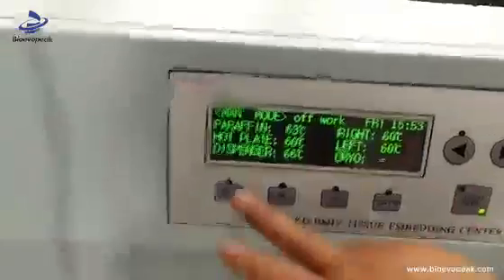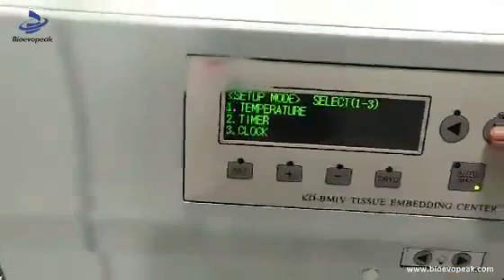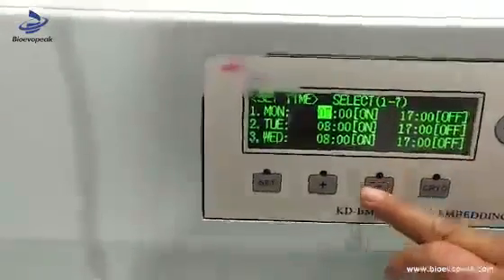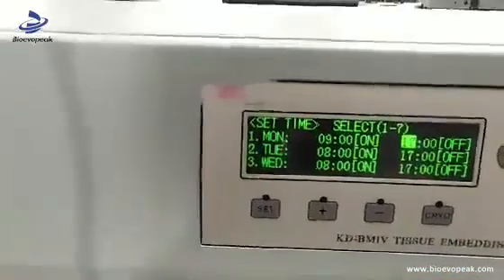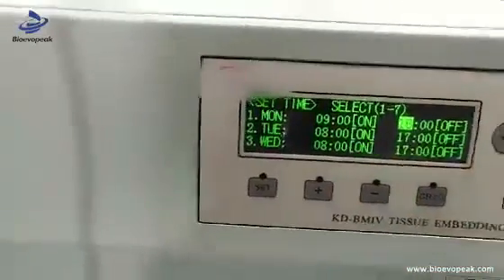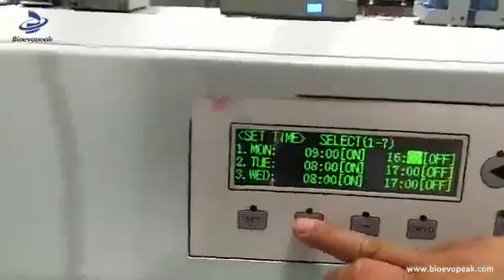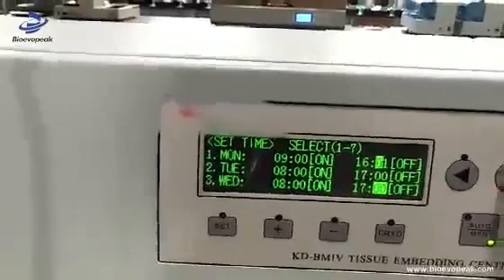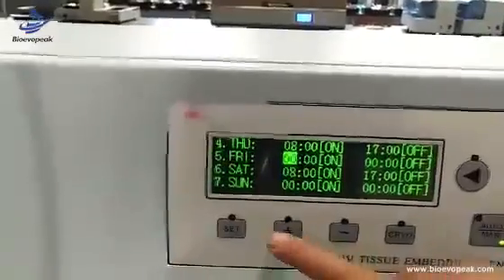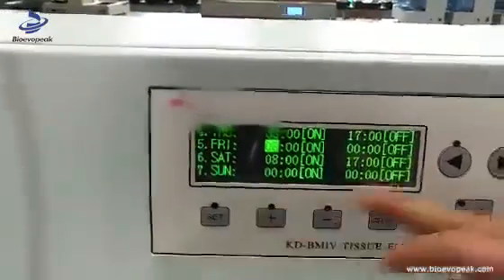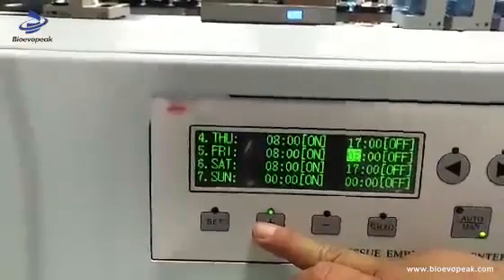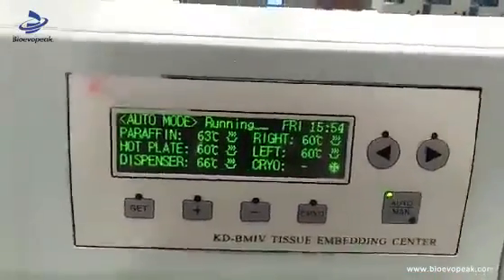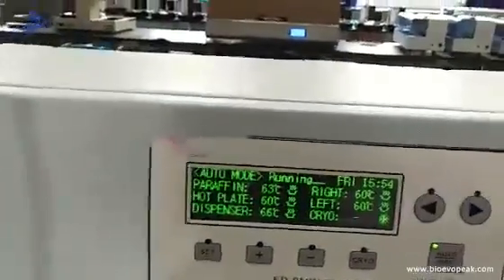We can also set the automatic mode. First, go to the work mode, then set the time for each day of the week: Monday, Tuesday, Wednesday, Thursday, Friday, Saturday, and Sunday. Set the automatic switch-on and automatic switch-off times that you want. Then press the automatic mode key and the machine will go to automatic mode.